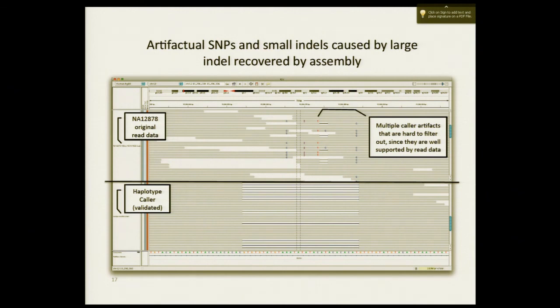What's up? So that's going to be very alignment specific, right? Like you were saying. But so you've done all this with BWA. The question, have you tried with other aligners to see whether you use Novoalign or something? Yeah. They actually perform well? So the thing is, you're right. If there's some aligner that would put this 22 base pair deletion in the reads, then the unified genotyper would call it, because it's very easy. Because it would come to this locus, it would find that there's reads with these deletions, and it would be able to propose that allele and do the right thing, sure.